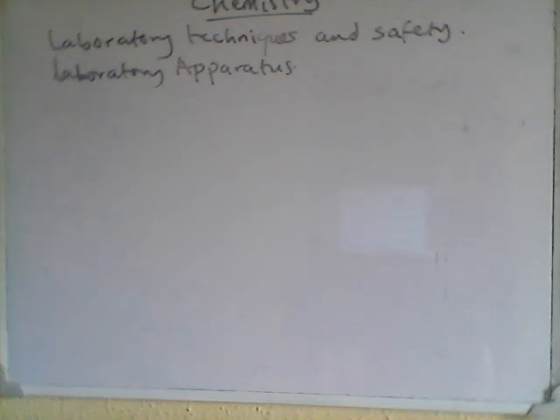So today we'll be looking at laboratory techniques and safety, subtitle laboratory apparatus. We will see what is laboratory safety, a chemical laboratory, for example. We'll look at common laboratory apparatus and their functions, and we will dive into basic laboratory techniques, laboratory safety rules, maintenance and handling of apparatus, and we'll also round up by looking at some WAEC NECO JAMB style questions on this topic. So sit tight.